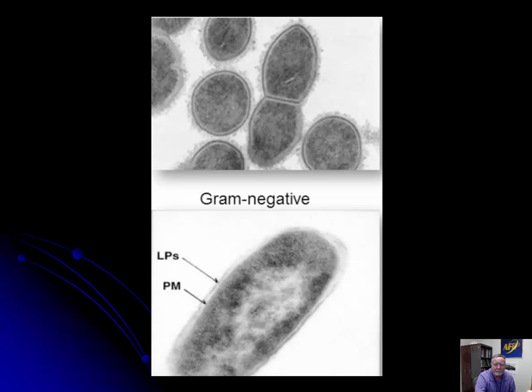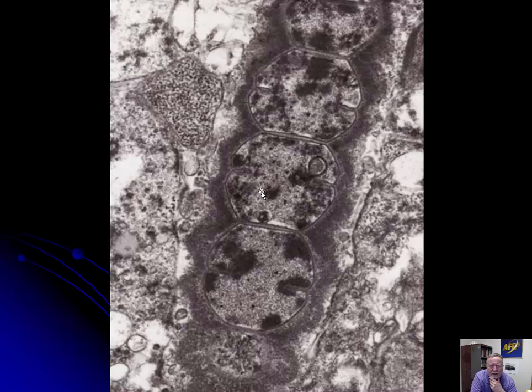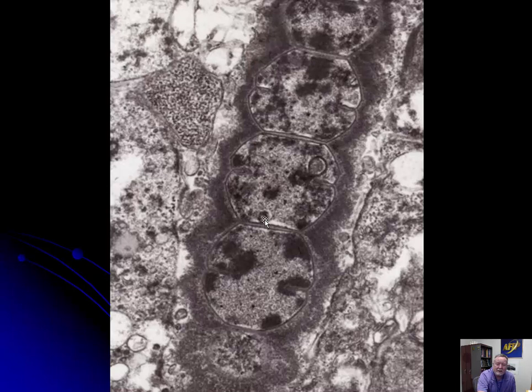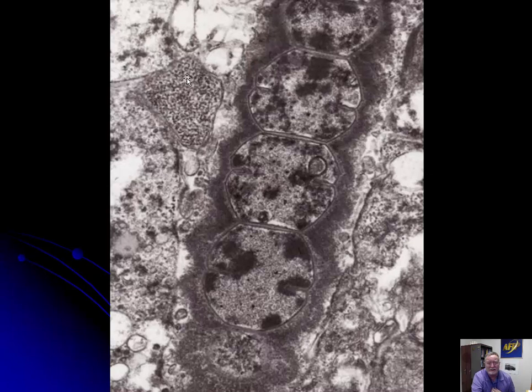Here is Streptococcus from a white-tailed deer. You can see infoldings of the plasma membrane. For many years people called these mesosomes and said they were the province of gram-positive agents — but it turns out they're an artifact of preparation. It's nice that it's in a chain, like strep should be, but it's really difficult at this magnification to tell where you are and what you're looking at. This is a nice picture of strep, but you do much better diagnosing bacteria from a little farther back — see what tissue you're in and how the bacteria interacts with it.